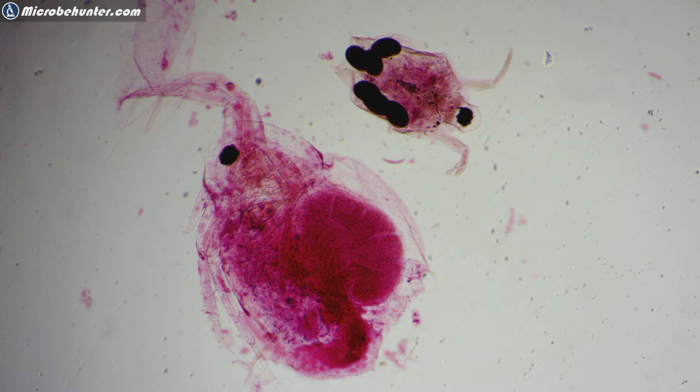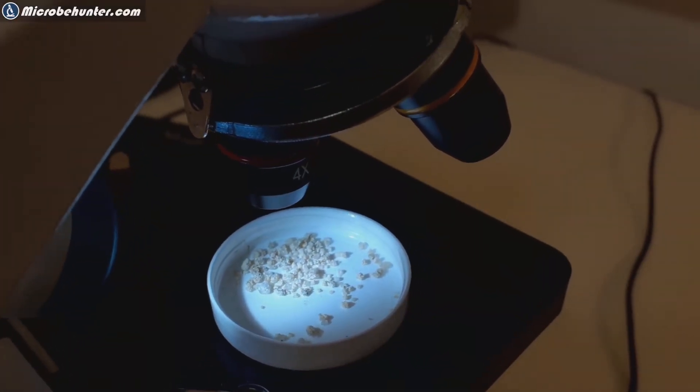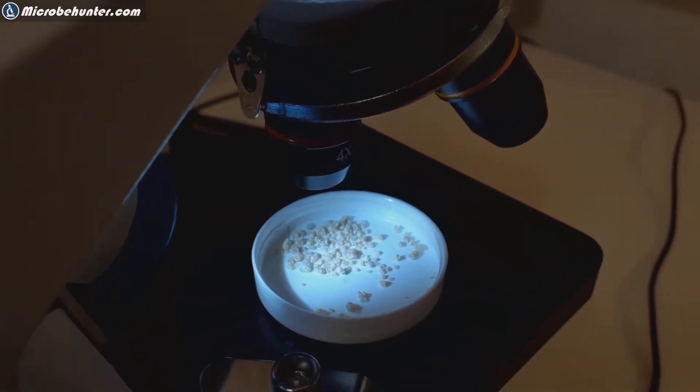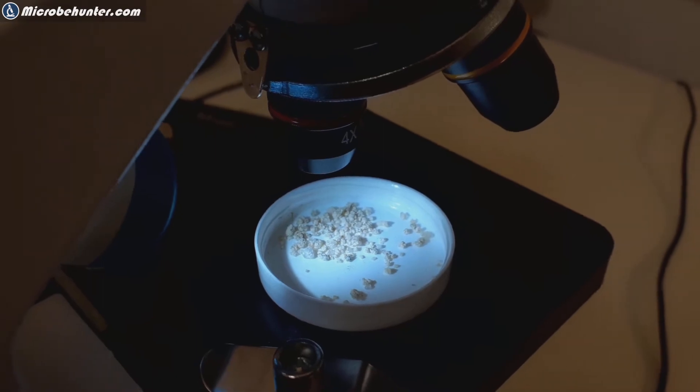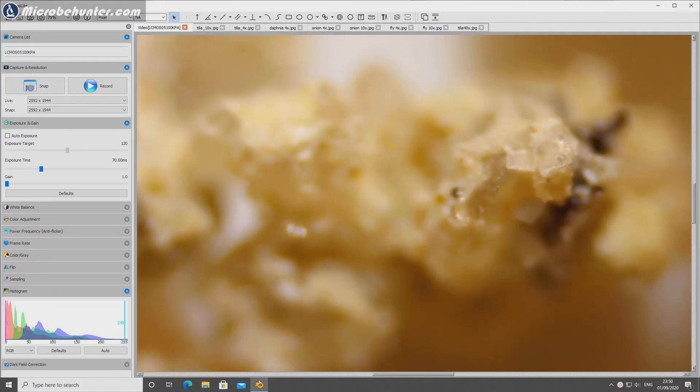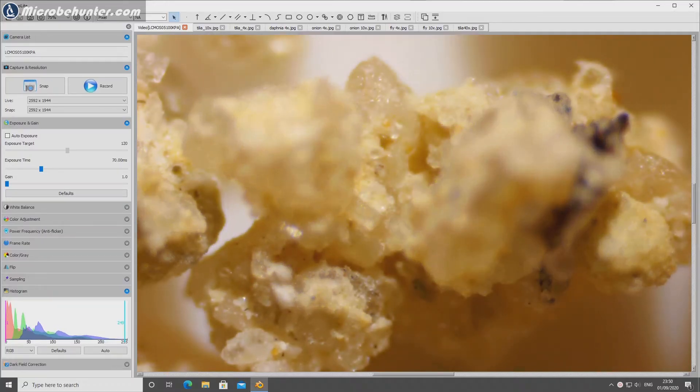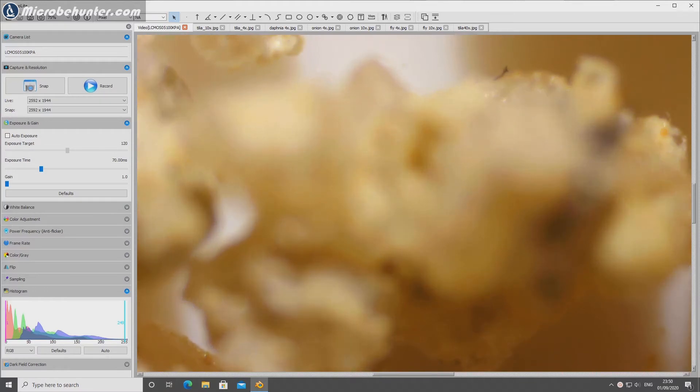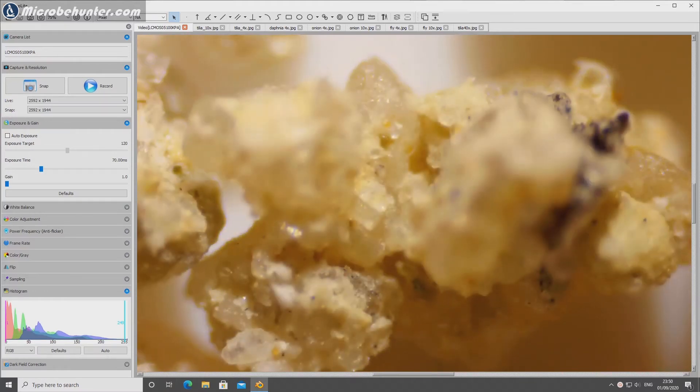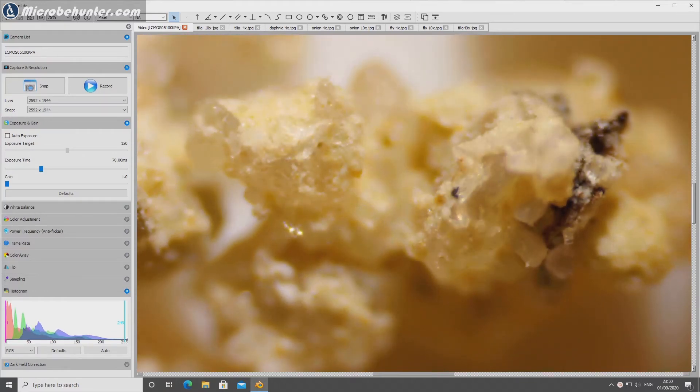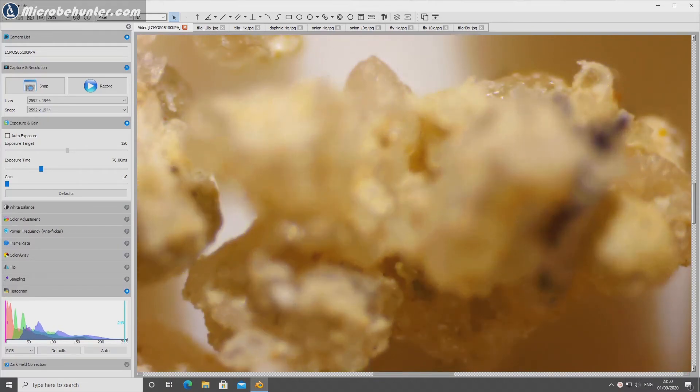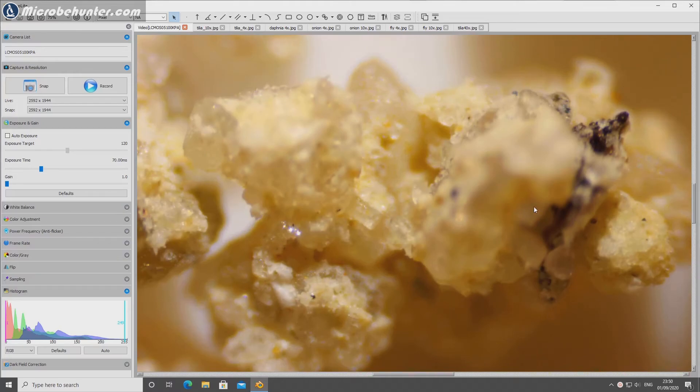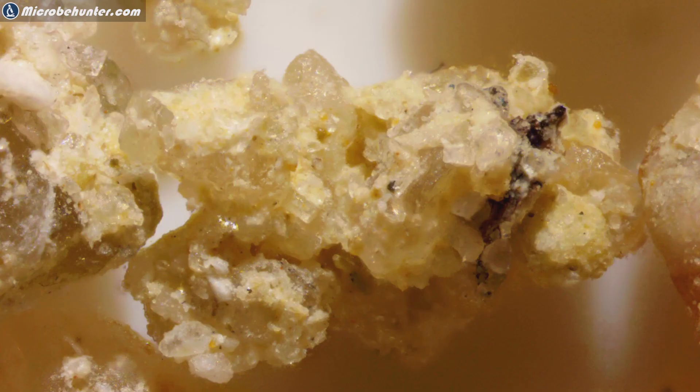So I now wanted to use top illumination and I put some sand under the microscope and I wanted to now test the lamp from the top, focusing back and forth. Of course you see that the depth of field as expected is quite low and what I did then is I took several pictures and I stacked the images together to make a picture that is completely in focus all the way through. So even this is possible, quite satisfied with that as well.